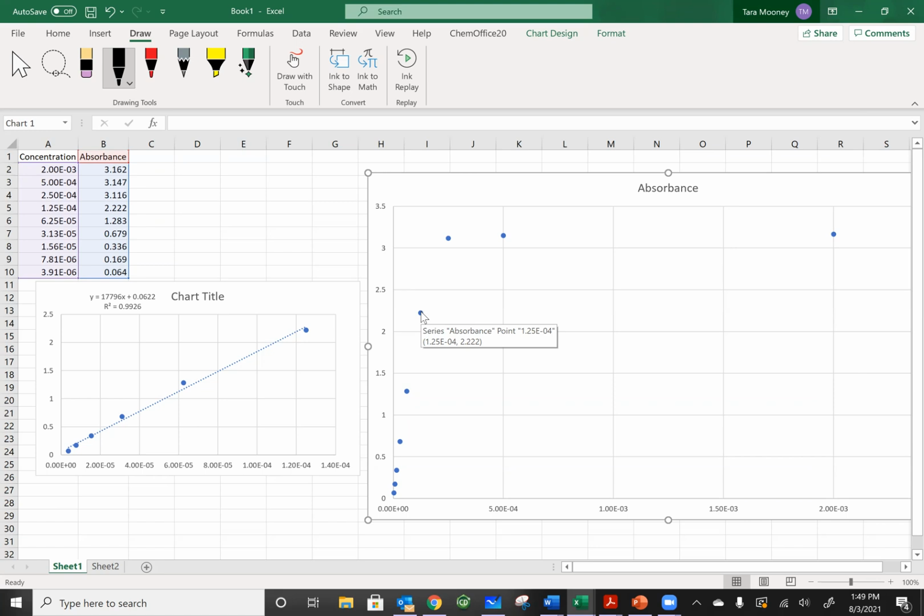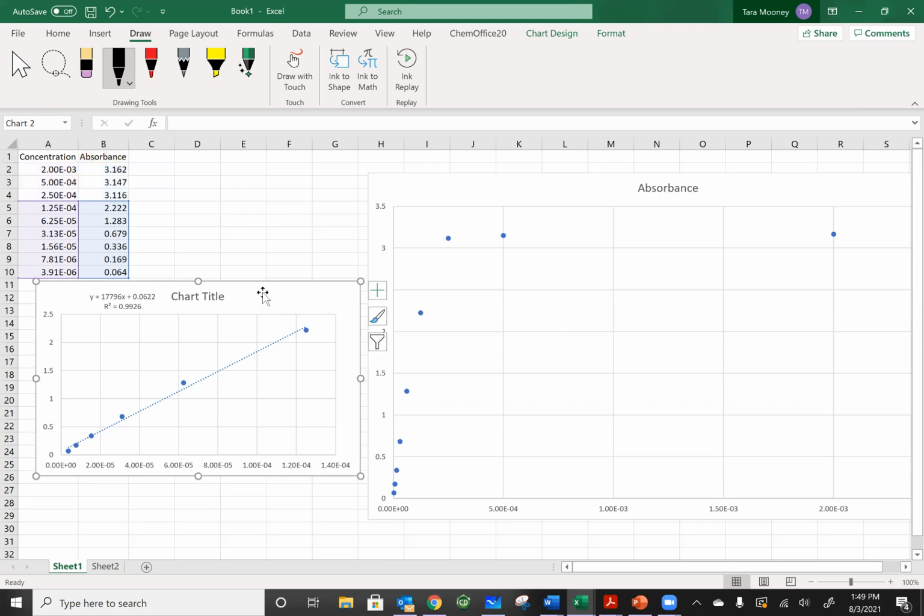Any other questions? Can you repeat what you said for the first discussion question about the linear? How you said the y-intercept is closer to 0? Yes. When you have 0 molecules in solution, or a concentration of 0, the absorbance should also be 0, because there aren't any molecules to absorb any of the light.